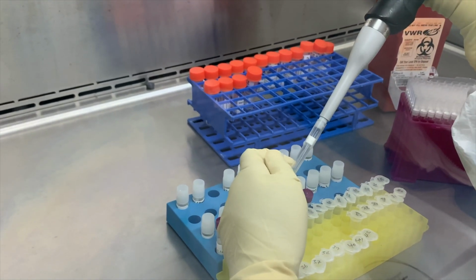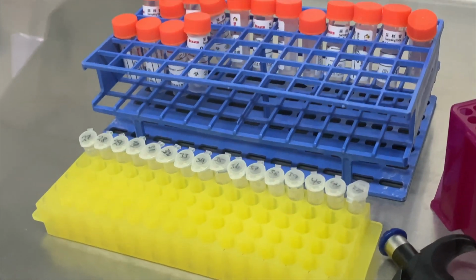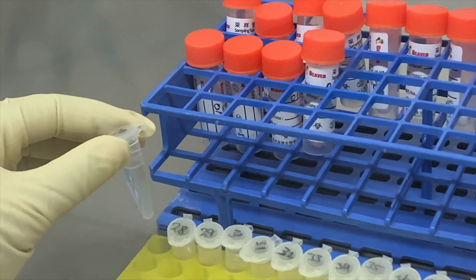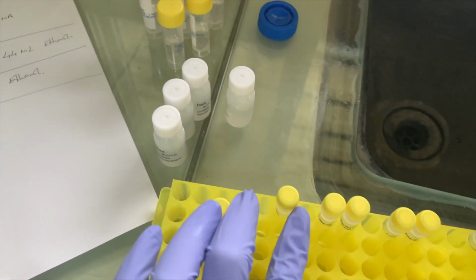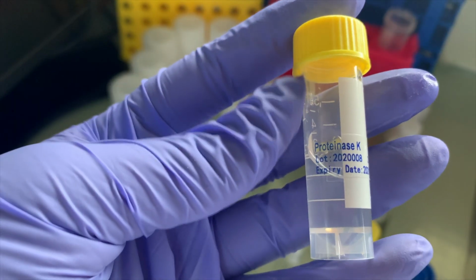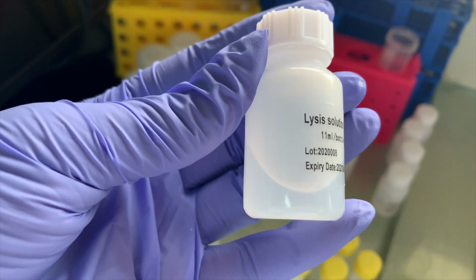All we have to do is extract RNA from the sample we got, because only when we extract the RNA can we tell whether this person is positive for COVID or not. Usually we use a couple of reagents. One of them is proteinase K. This is the proteinase K. It breaks down the proteins inside the sample. Next, we add the lysis buffer.